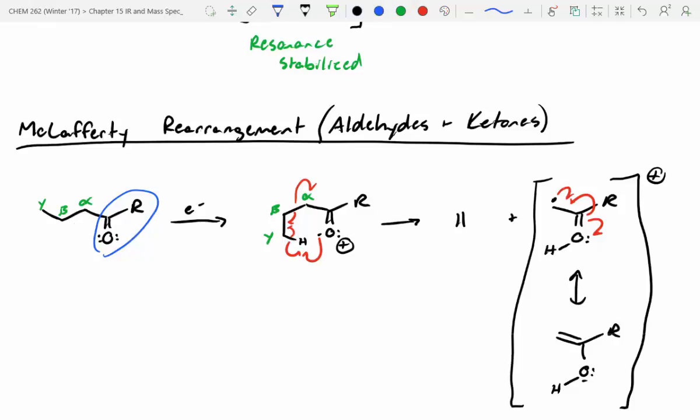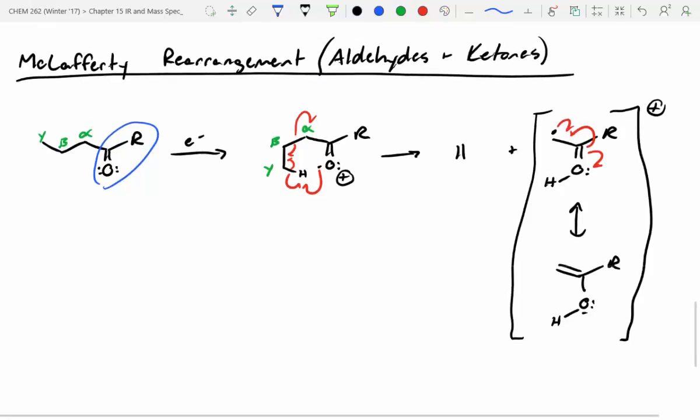But isn't the oxygen the functional group? No, the entire CO double bond with the CH3 or whatever coming off is. That's what I meant, not including the R group. Like, the carbonyl is the functional group, not this with the R coming off, right? I know it can be confusing, but with any carbonyl group, the carbon that's one away from the carbonyl carbon is the alpha position. It's just historically how it's always been. That's right.